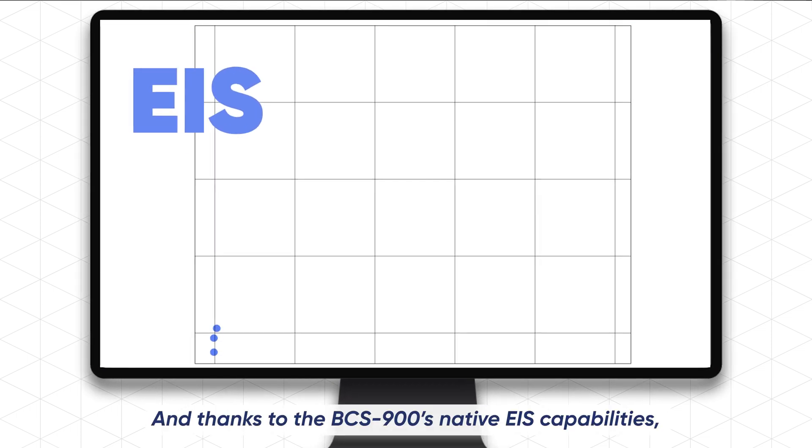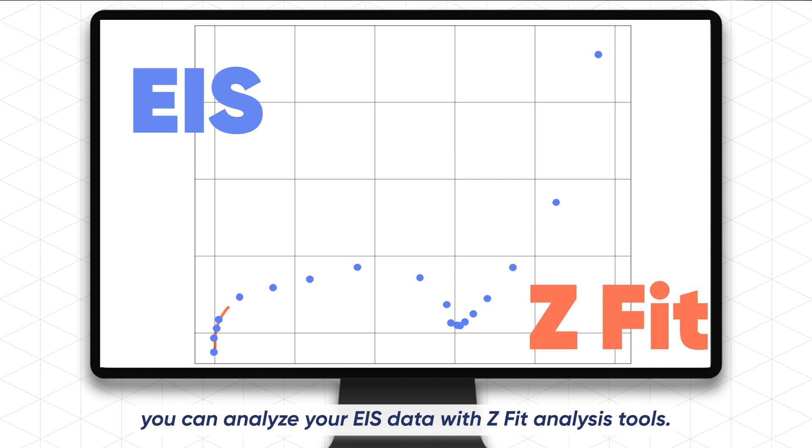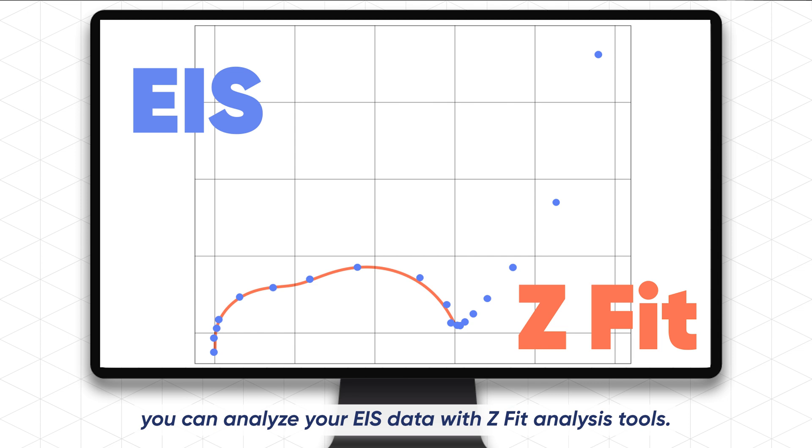And thanks to the BCS900's native EIS capabilities, you can analyze your EIS data with Z Fit analysis tools.